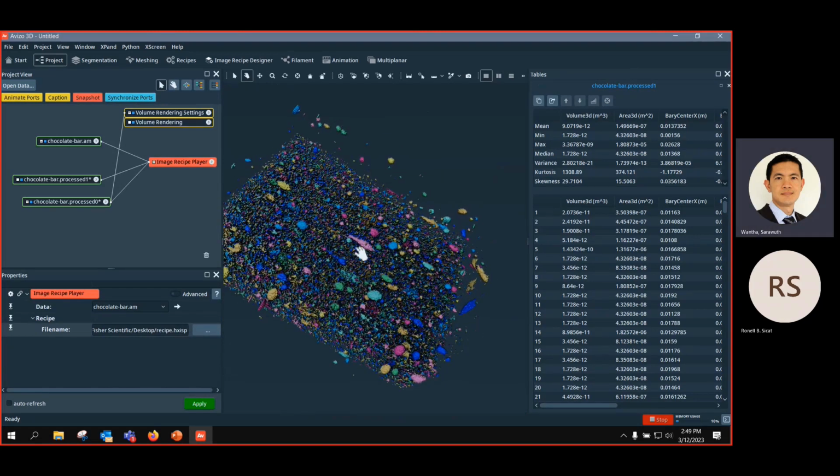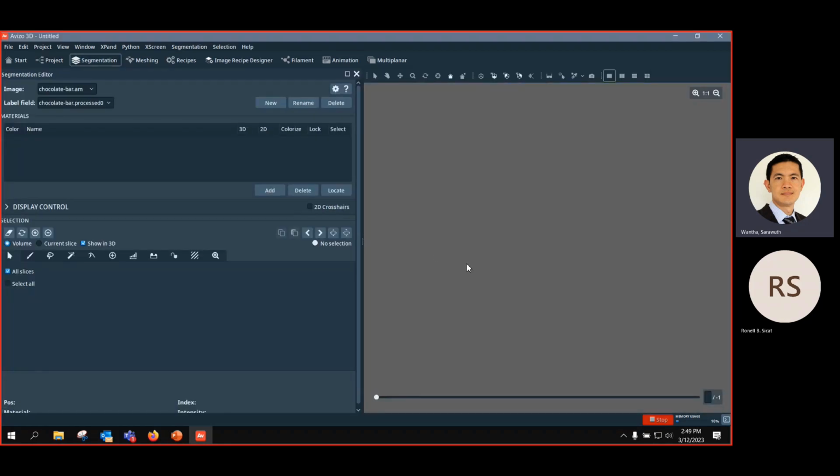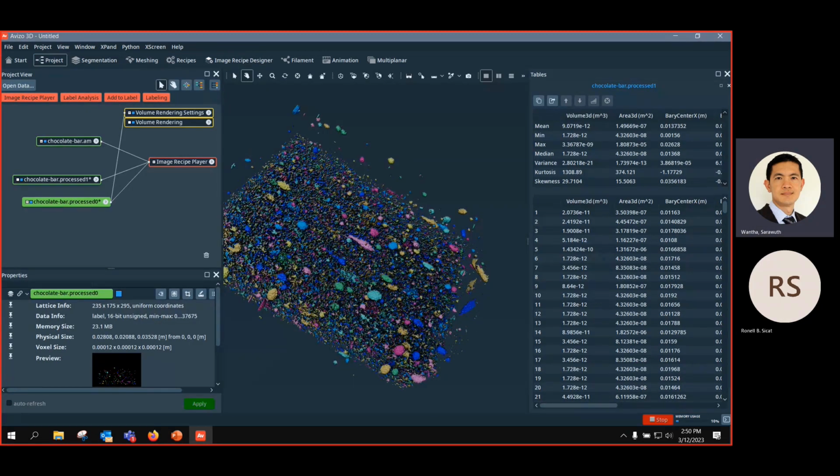That would be all for now. So tomorrow we will start on another segmentation workflow, and separation of objects with watershed segmentation and so on, and also a new feature in the segmentation workflow. It's going to be a lot too, and it would be nice if you could bring some mouse. I think it'd be easier for you to manipulate the software, because with our mouse it's very difficult.